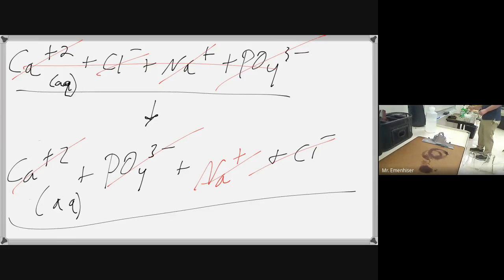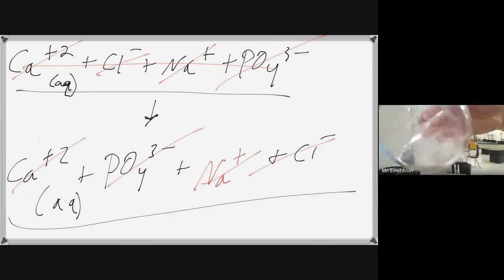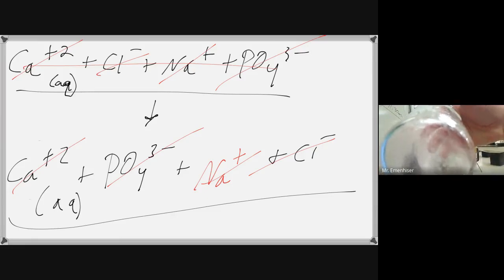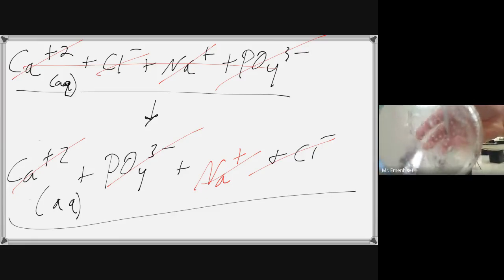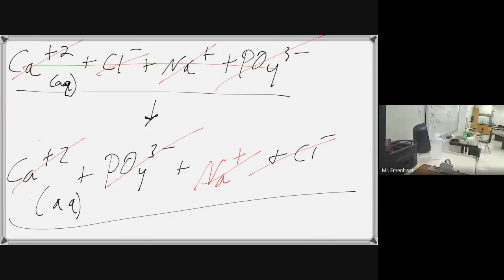That's number 6. I don't have much of number 6 left, but I'll show you what I do have. There's nothing really exciting in here, but there is something at the bottom of the container. The water's gone, but I don't know what's in the bottom of the beaker there. But there's no solid. So that's number 6.